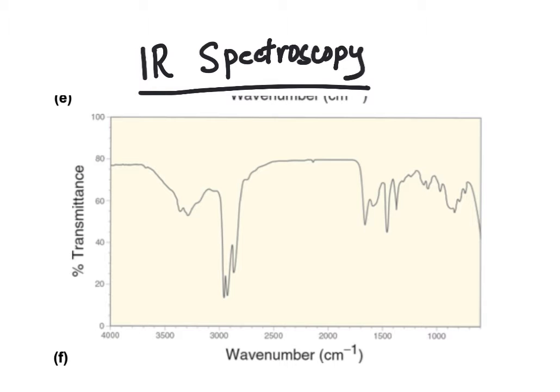In this video, we're going to go through IR spectroscopy. I'm going to approach this a little bit differently than I did in the lecture notes. I'm not going to focus a terrible amount on the theory. I'm going to go through what an IR spectrum, as what you can see here, means, and then how we can use it to deduce molecular structure.